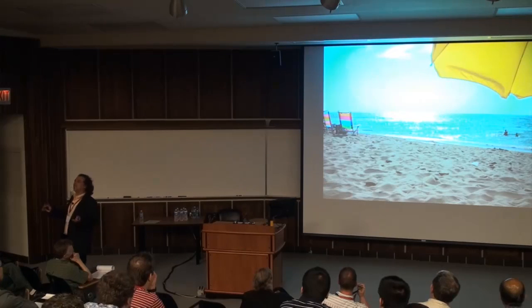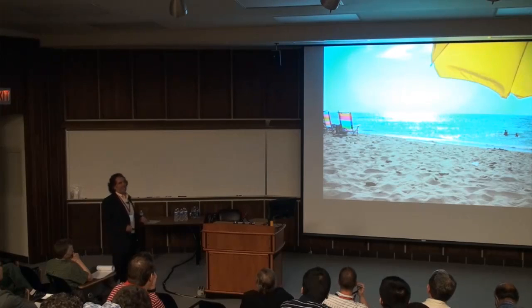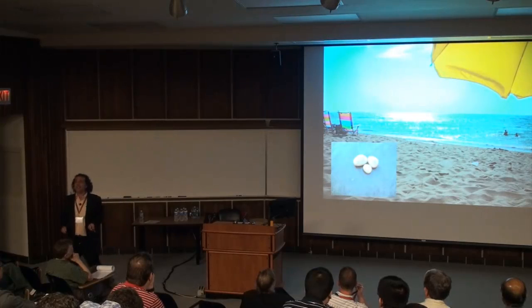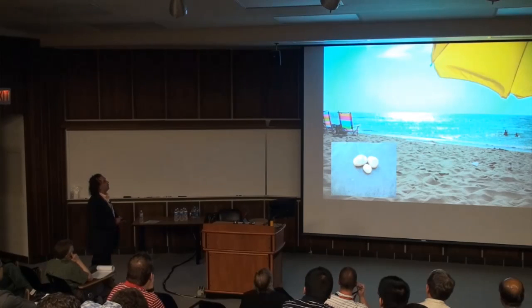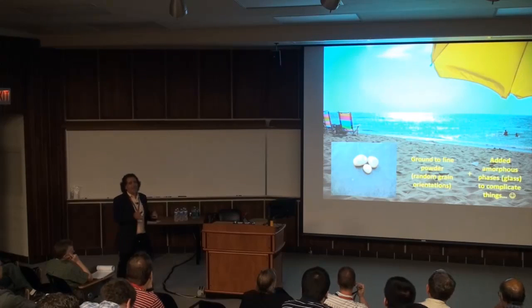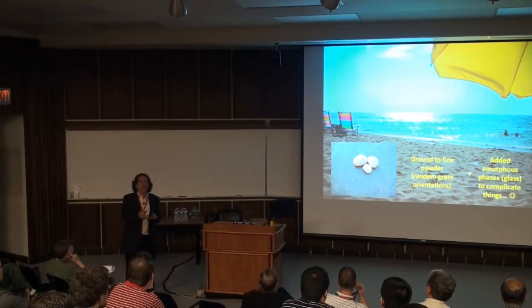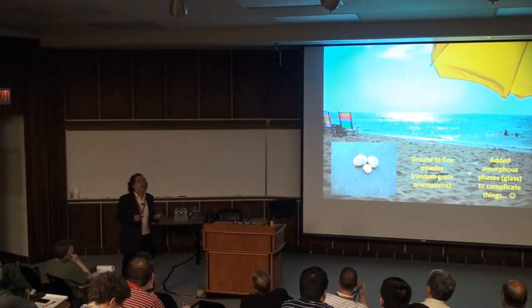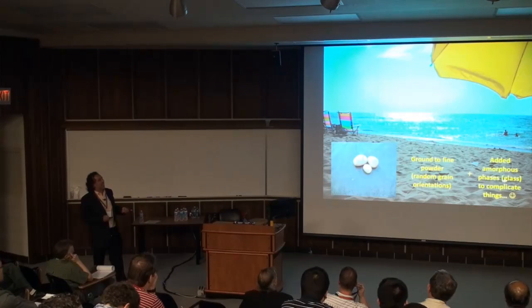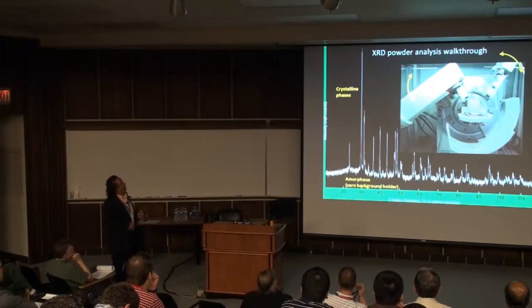Oof, I got tired. I'm going to walk you through data analysis on one sample. A couple of years ago, last year, I was at the beach, and I decided to pick up a piece of rock and look at it. The first thing we did was to grind it. Why did I grind it? Since I didn't know what it was inside, I ground it into a fine powder to make it random. And to make things even more fun, meaning more complicated, I added some amorphous material, whose amount I knew. Then I took that to the X-ray machine.